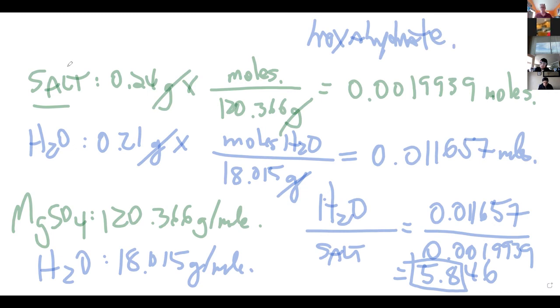And I think that's pretty much exactly what I got last term as well. 6 rather than 7. I think most people got 6 rather than 7. So those are the two things I would suggest: spreading your crystals out a little further apart from each other, and maybe heating it for slightly longer. I think I let it go for like 12 minutes. You can let it go a little bit longer if you like.